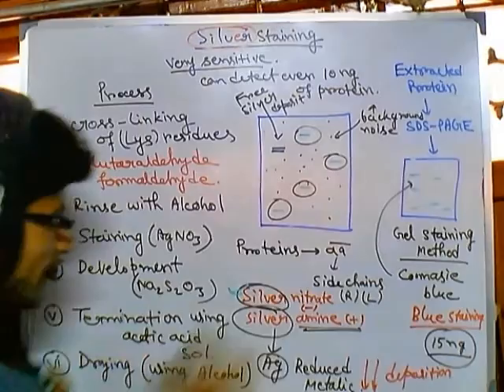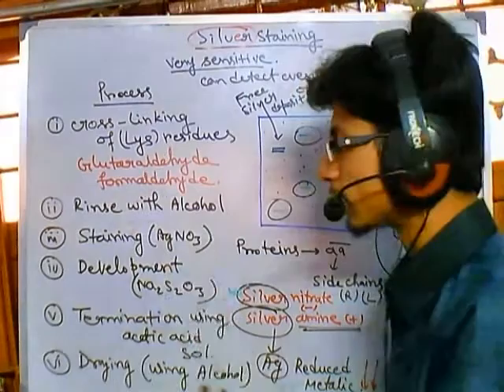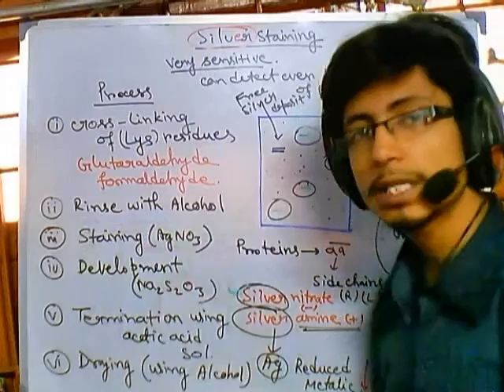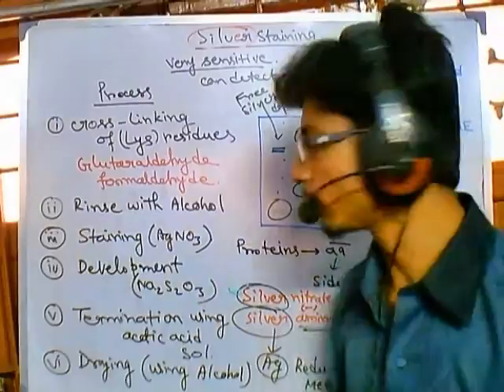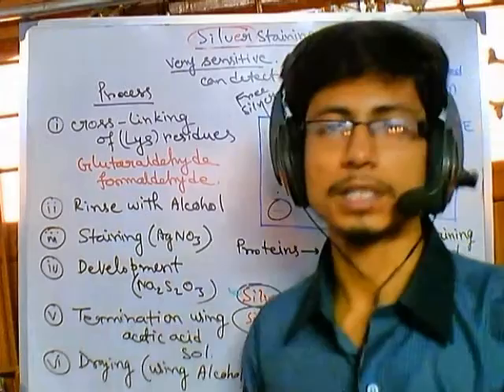First is the cross-linking stage of lysines using glutaraldehyde or formaldehyde, then the rinsing with alcohol, then staining with silver nitrate. But oh, remember, I forgot to mention, before staining we need to sensitize our gel. Sensitization is important. Sensitization is achieved by treatment with sodium thiosulfate solution again, then we use the development, then the termination of the reaction, and then finally we dry this gel. After the drying of the gel, the gel is ready.